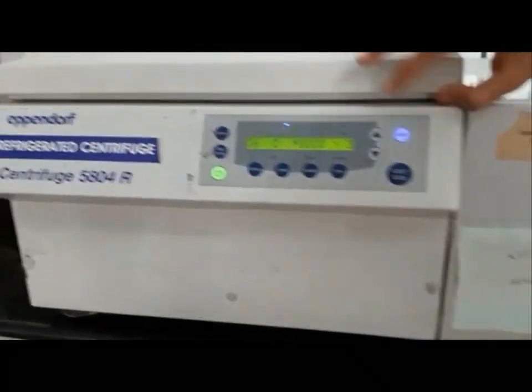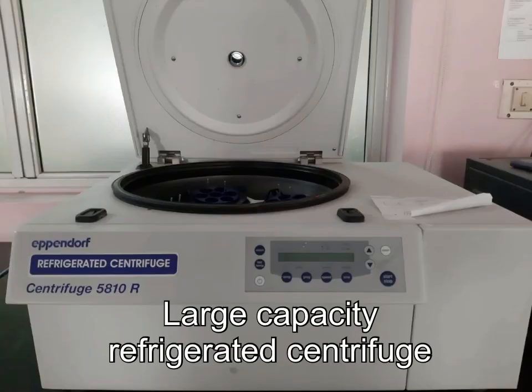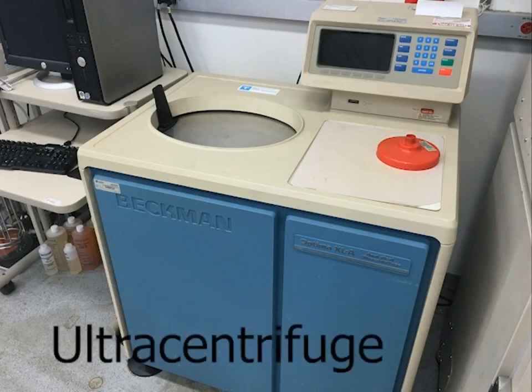There are four major types of centrifuges: small bench centrifuges, large capacity refrigerator centrifuges, high speed refrigerator centrifuges, and ultracentrifuges. In ultracentrifuges, there are two types: preparative ultra centrifuge and analytical ultra centrifuge.